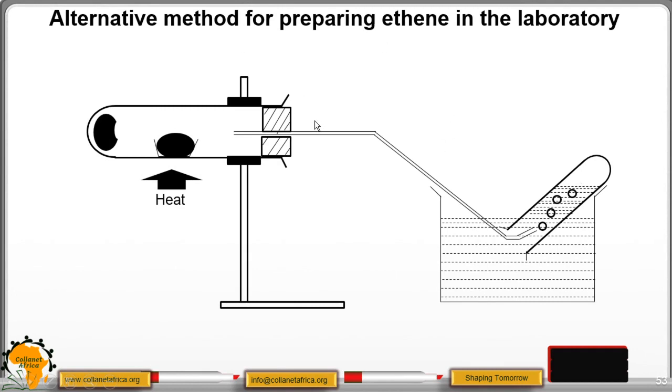This is the alternative method that you can utilize to prepare ethene gas in the lab. We have hard glass tube. We have our aluminum oxide. The aluminum oxide has two functions. It acts as a catalyst as well as a dehydrating agent because in this process, we are still dehydrating ethanol. We have our ethanol in a cotton wool. It is soaked in a cotton wool.